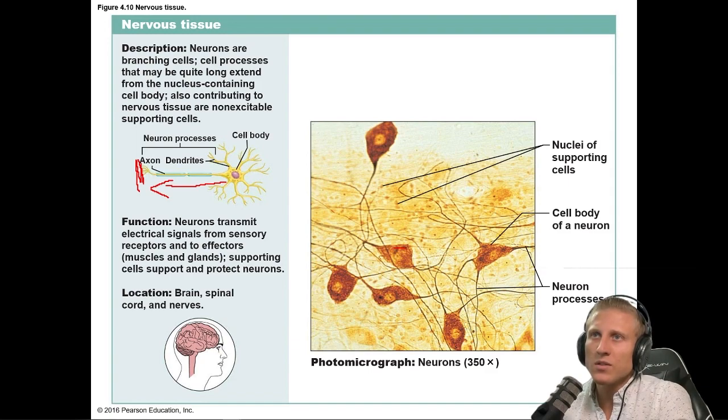So here we can see these are the cell bodies, okay? And then if we're just visually looking at it, it can be relatively hard to distinguish an axon from a dendrite. I think the only really easily distinguished one is this guy right here being an axon. Of course, we see this throughout the central nervous system as well as peripheral nervous system, right? Neurons. And that is it. Congratulations. We're done with main histology slide.